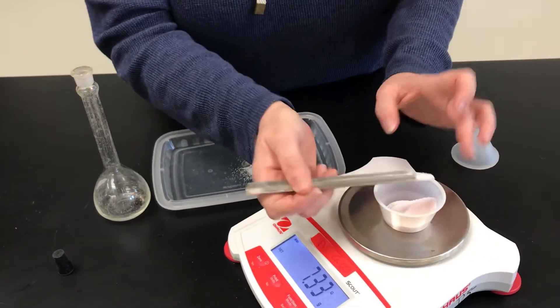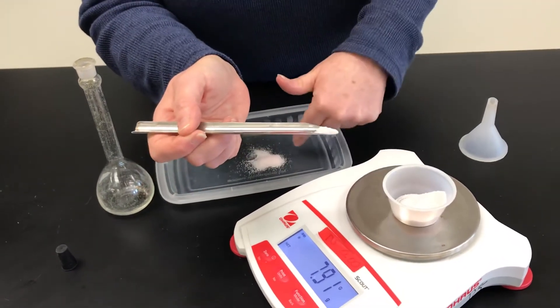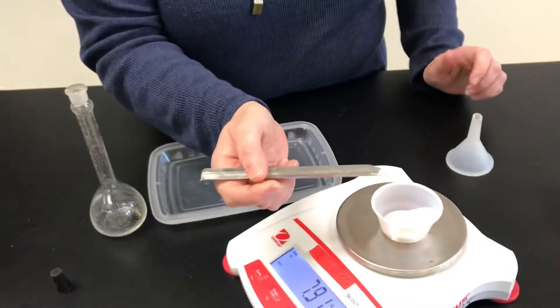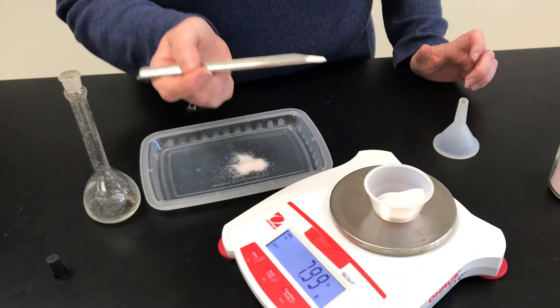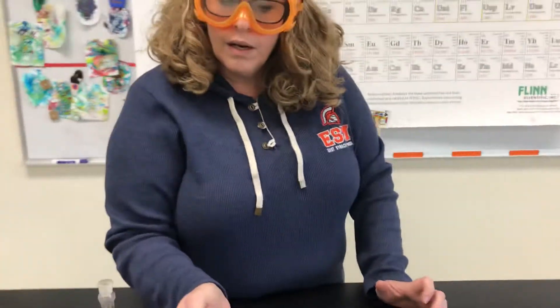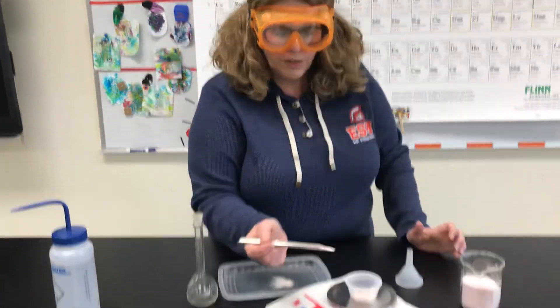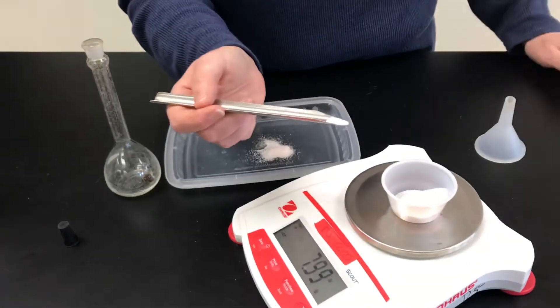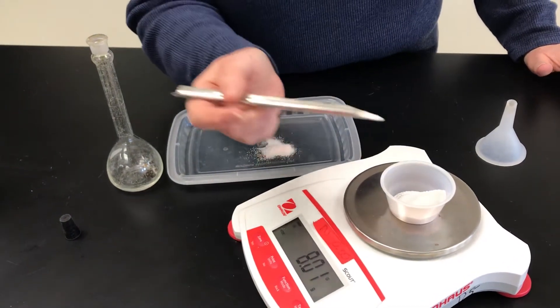So I can try to get as precise as possible. So now that's 7.92. I haven't transferred this over yet — it's still on my spatula. Why does it keep fluctuating? Because remember, our balance is estimating that last digit — significant figures. And then we have some air current going around here too. So let's just add another little grain or two.